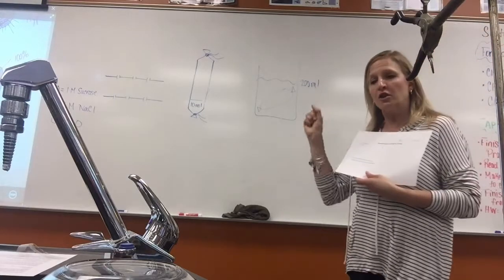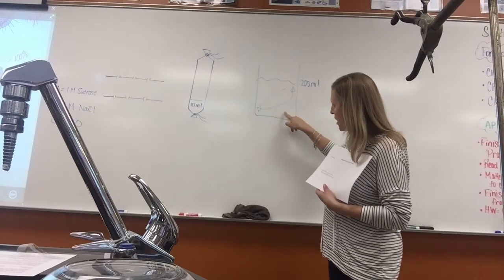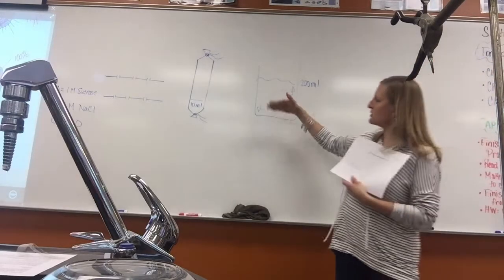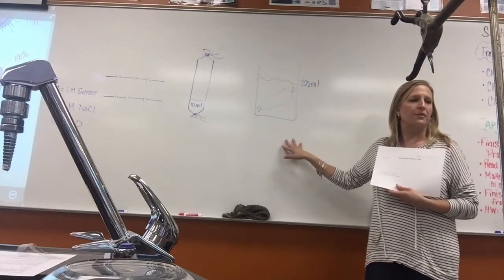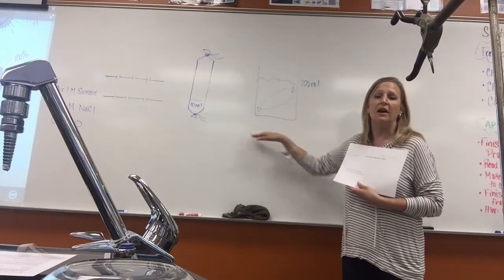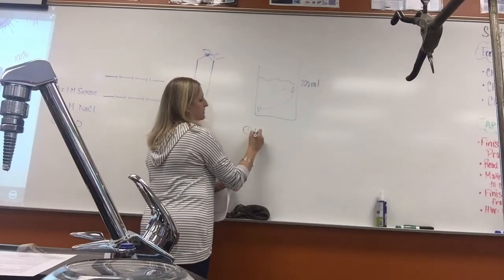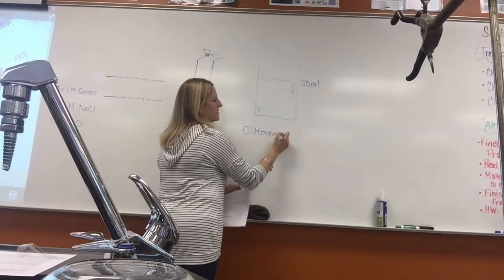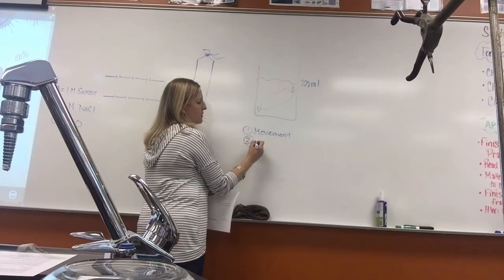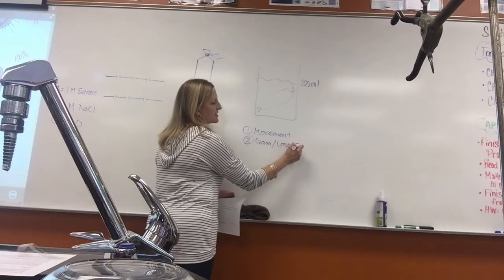So therefore, where you write the molecule here, like water, if you think water is going to go into the cell, you write water on the outside and then an arrow in that water is going to go in. And then underneath it, I want you to write that out. So I think this is what's going to happen in terms of the movement of molecules. So underneath it, write about the movement of molecules, and then the second part of what I want you to write underneath there is whether or not you think it's going to gain or lose or stay the same, the mass.